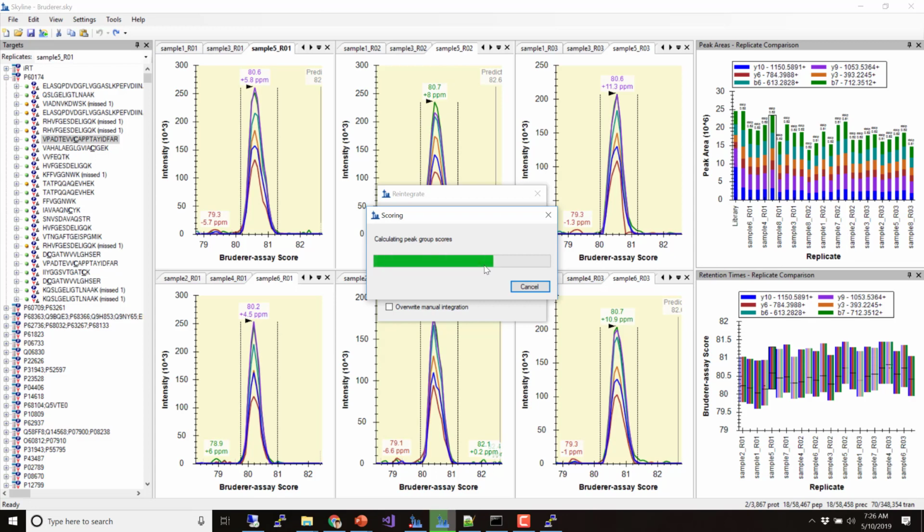So that was passing my FDR for database searching, with the DDA FDR. I'd run some DDA runs, and so yeah, there's several levels of false discovery rate here. There's a fair amount of error control. If at every step of your experiment you allow more error, then you're just going to end up with a lot of error at the end. So that was just control of our library.